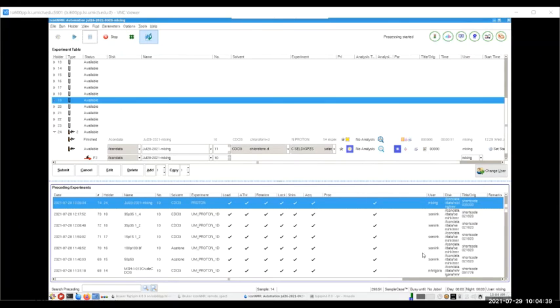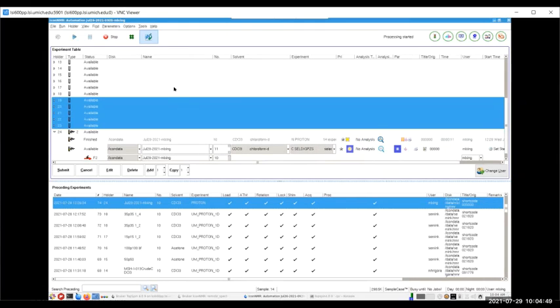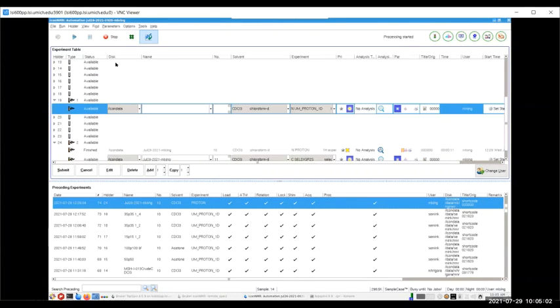Okay, so now I hope everybody can see the ICON-NMR screen now. This is the software that we use to control the spectrometer, the 600 megahertz in Marysville Coleman Hall. When you log in, you will see the holder numbers here. Just pick the holder that you put your sample in, and double click.